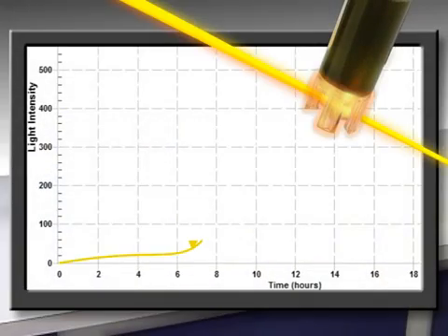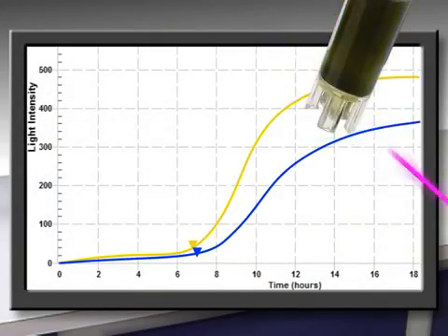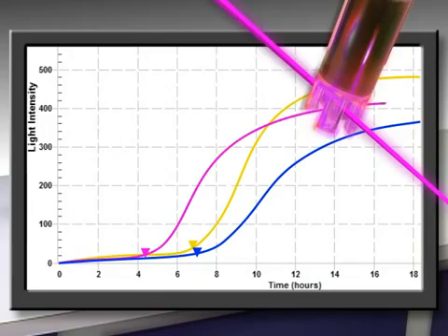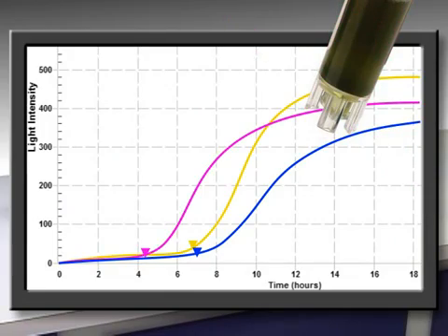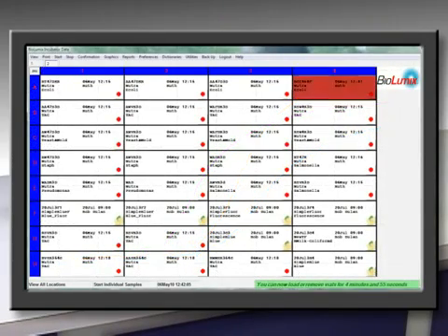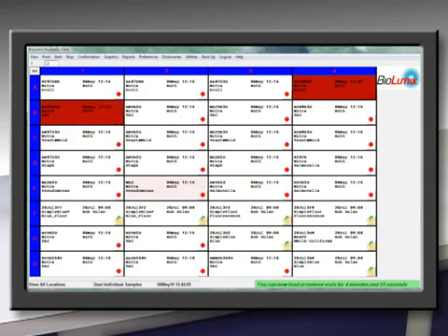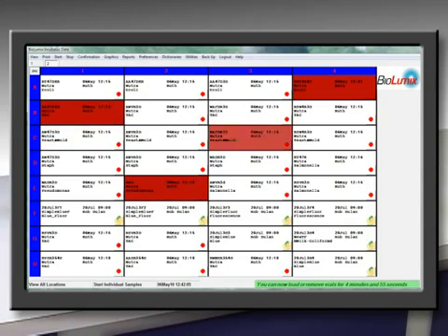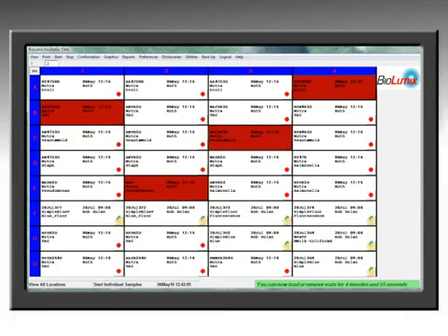The vial is continuously monitored with three optical signals. The data is transferred in real time to alert the user of any problems.